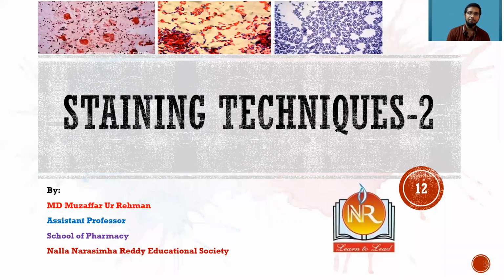Welcome to the second part of staining techniques. Last video we studied the various methods of staining. We classified them and studied simple staining and differential staining. In differential staining we studied the identification part, that is gram staining and acid fast staining.